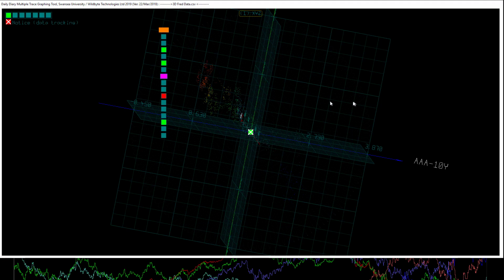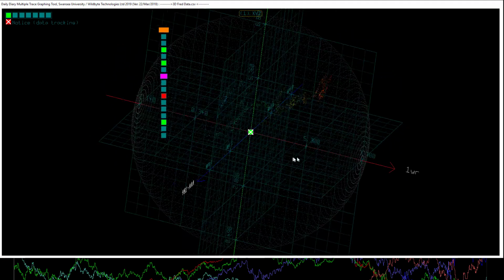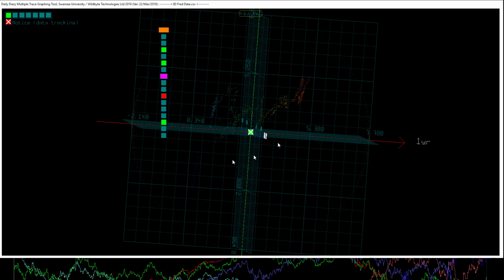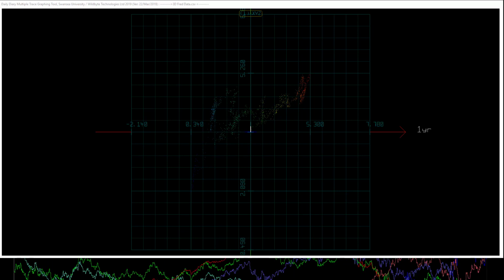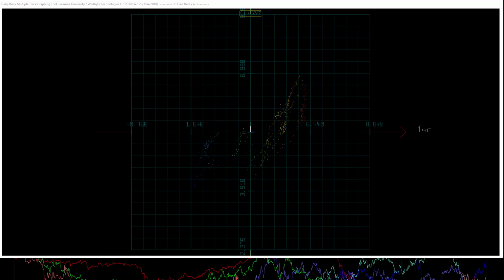So it's basically off center, and each of the three axes are not the same scale. They were normalized for the data you view. So if I reset that to make it clear, as I move through the data, you'll see the numbers on the left side of the red axis will rescale based on the data. Same for the y-axis as well.